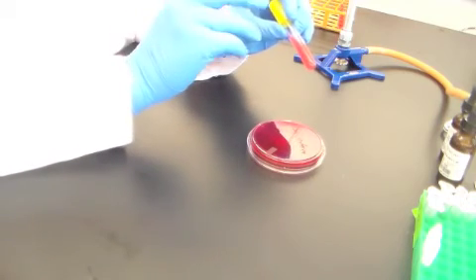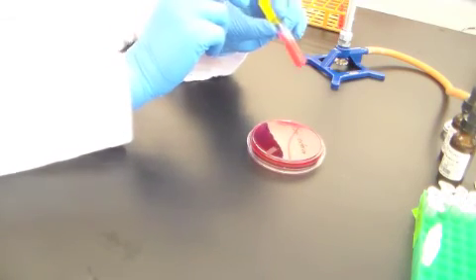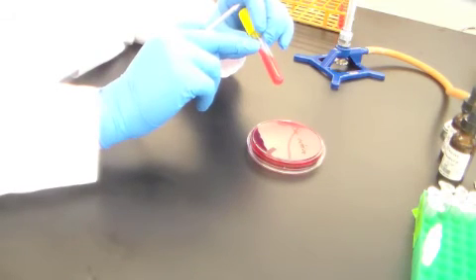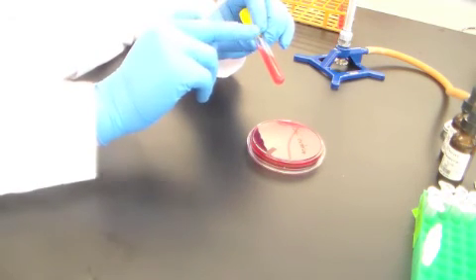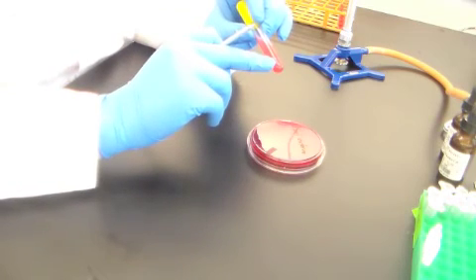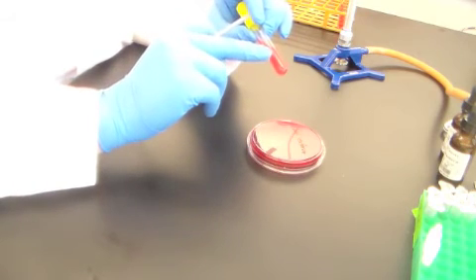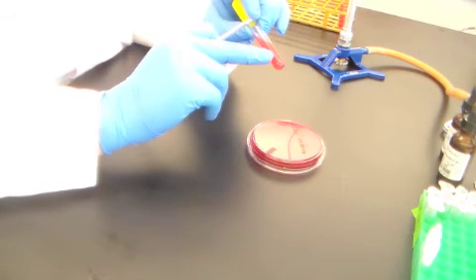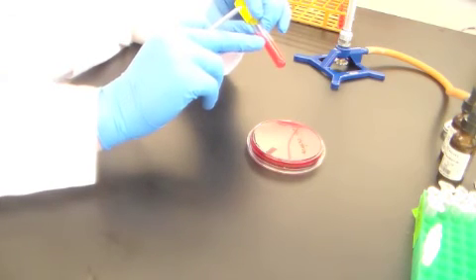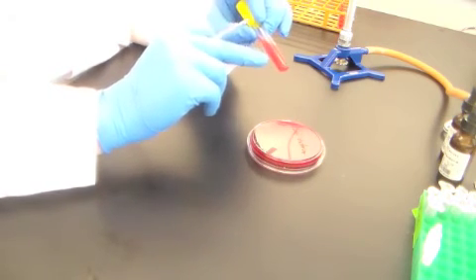What you're doing is setting up a biphasic type of culture where the bacteria, in this case Salmonella, are going to grow aerobically on the surface. They're going to be in contact with oxygen at all times. The Salmonella that you have inoculated down into the agar deep portion will utilize the oxygen in that environment quite readily, but oxygen doesn't diffuse very well in fluids, and even worse perhaps in agar.